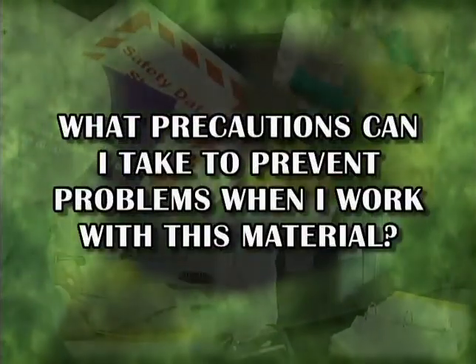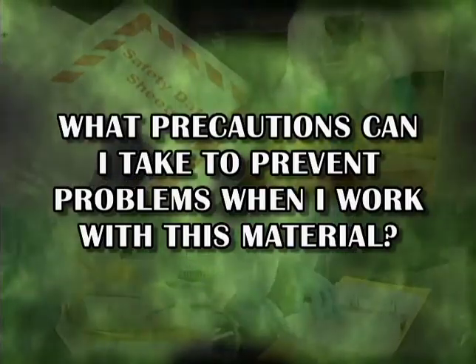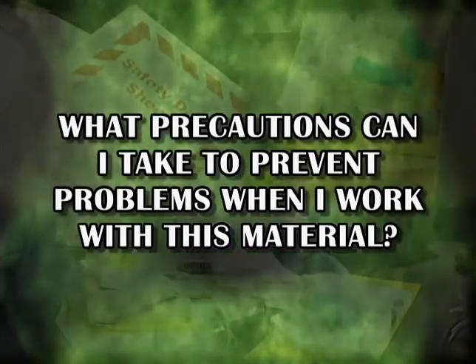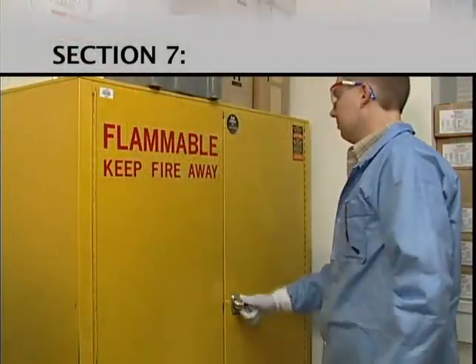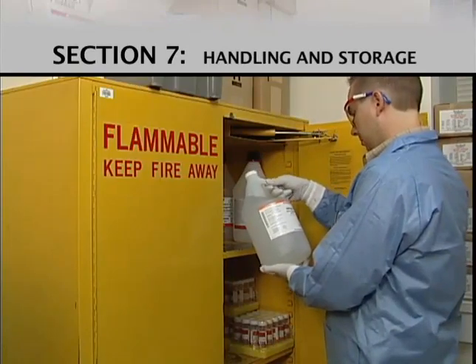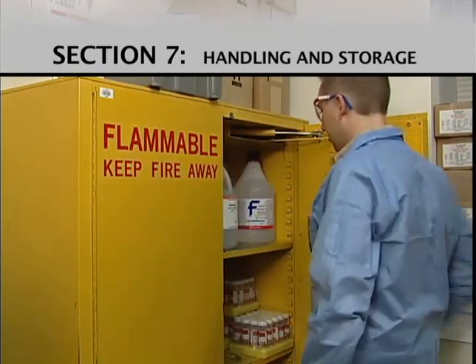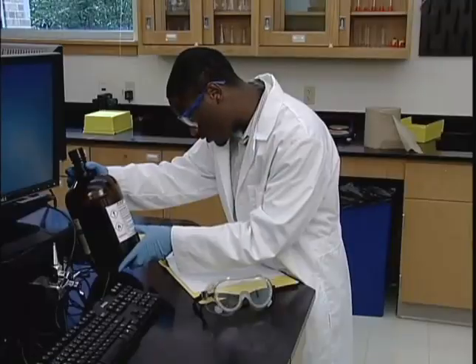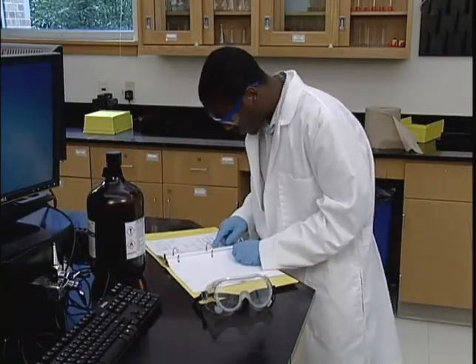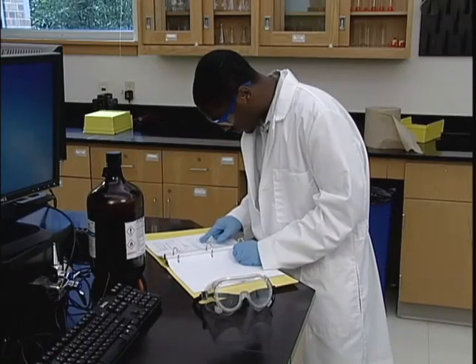The next question the safety data sheet addresses is, what precautions can I take to prevent problems when I work with this material? For answers, we turn to Sections 7, 8, 9, and 10. Section 7 covers handling and storage practices that will minimize the physical and health hazards of the material as well as preserve its quality. As you would expect, the handling instructions on the SDS are often the same as the ones listed on the chemical's container label.